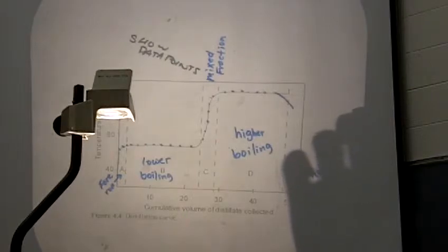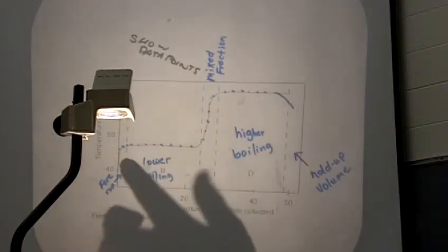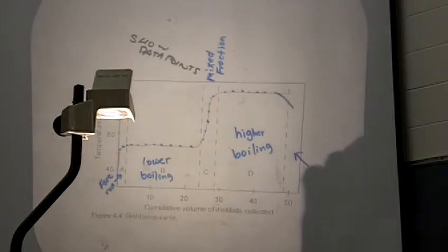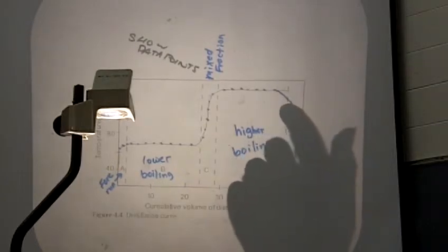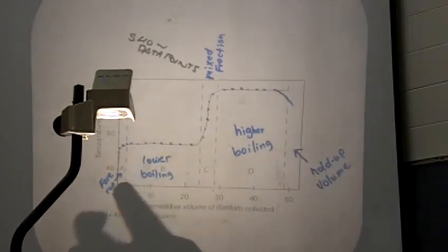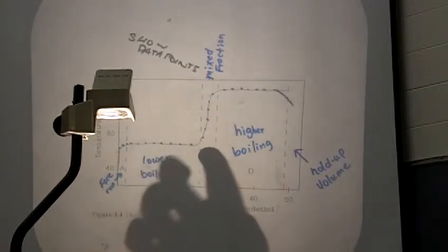Yep. Let's problem because we have impurities in our first distillation. Well, that's why we want to keep collecting fractions. So yes, if you do have impurities, it's going to cause a problem. Same with over here, if you have impurities, it's going to cause a problem, okay? So ideally, you need to watch the temperature and figure out when you're going to be changing your fractions based on the temperature, okay?